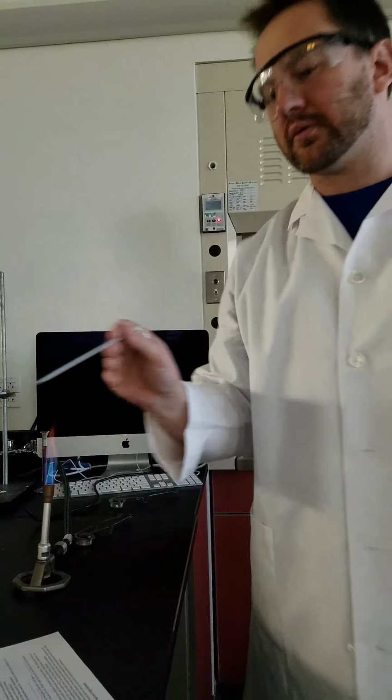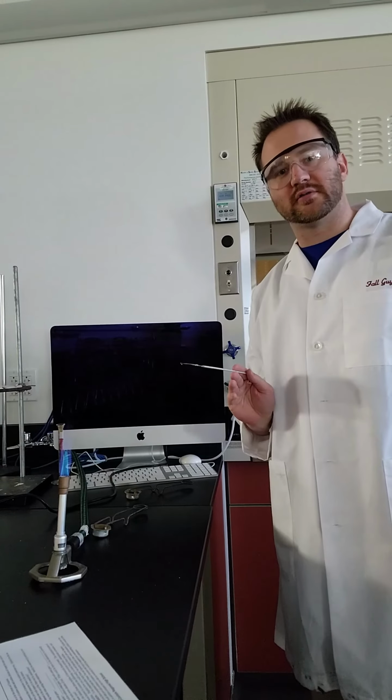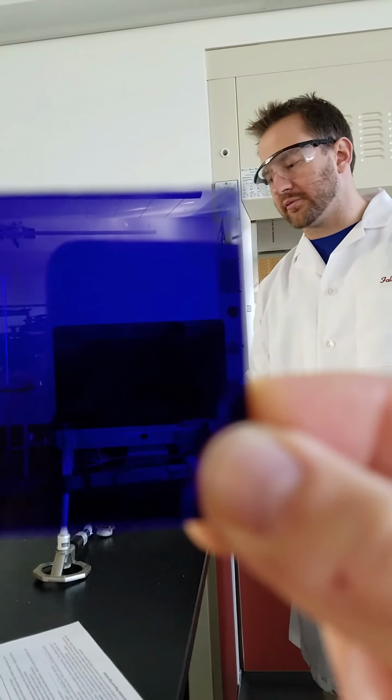Now I'm going to show you something that's kind of cool, and how we can use optical filters to isolate a certain set of wavelengths, or a specific wavelength even, if we want to. You've already seen sodium and its color without a cobalt lens, but now when we look at it through a cobalt lens, it changes dramatically what we can observe. Since that lens basically only lets violet light come through, you really can't see much of that flame, even though that was a very bright, intense color.